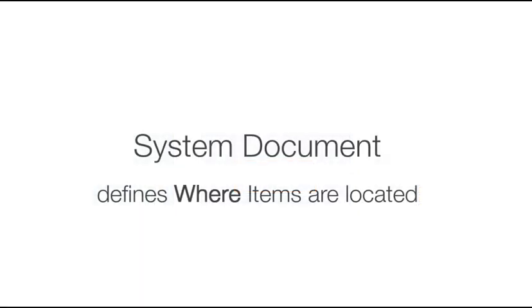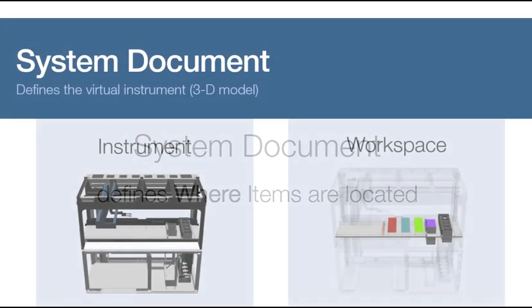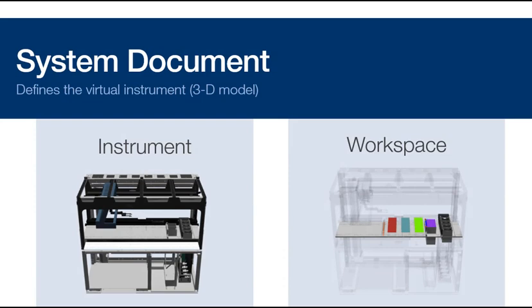To build an assay, we begin with a system document so that InstinctV knows where all the items are located for the assay. The system document defines both the instrument hardware and the workspace labware. So let's begin by examining the existing system document created for this video.